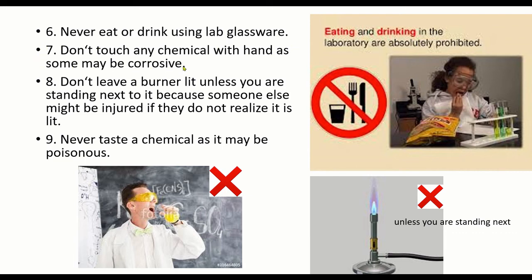If something happens, if there is any damage to the equipment, you have to inform the lab technicians. This is quite important to avoid any damage. You don't have to be scared if there is any damage. The things will be taken care of by the lab assistant, but informing the lab assistant is quite necessary, because if there is any damage which can be saved, it can be done right away.